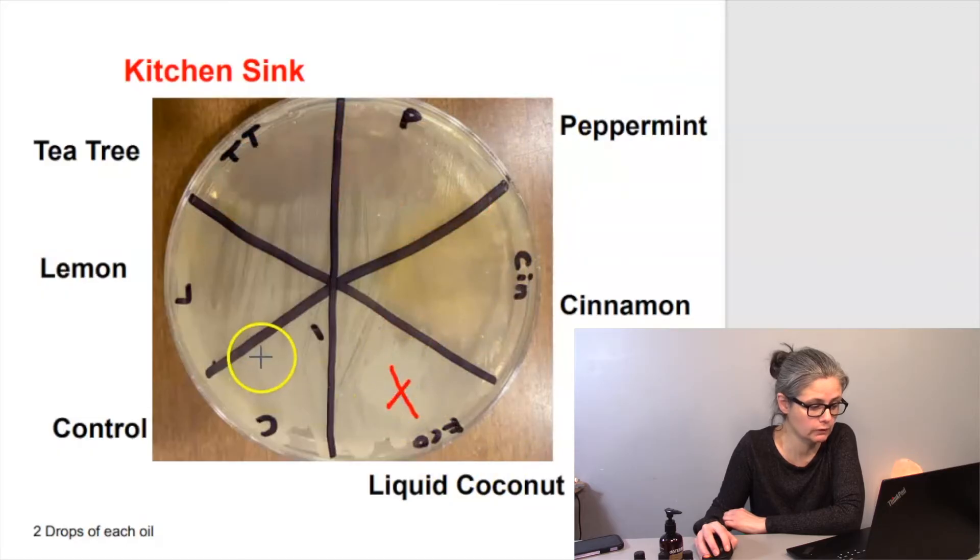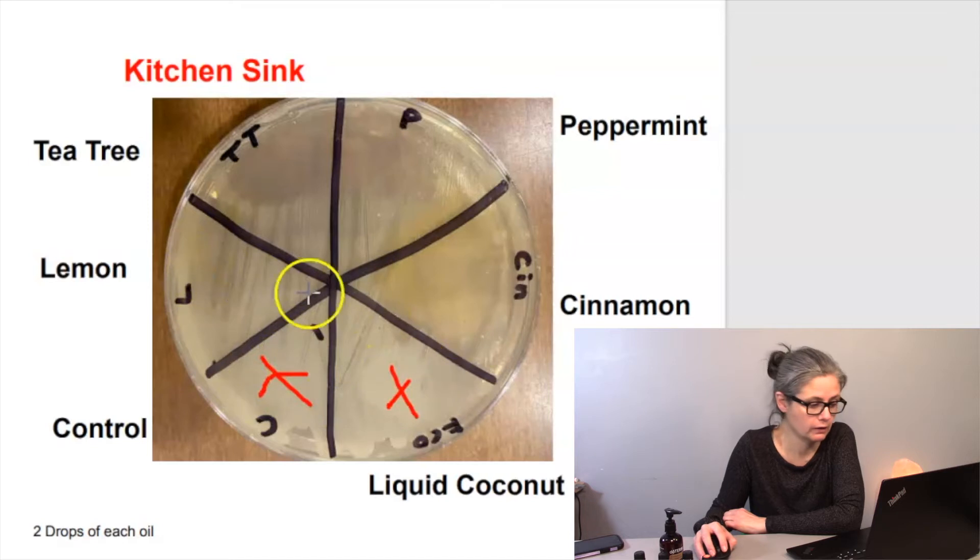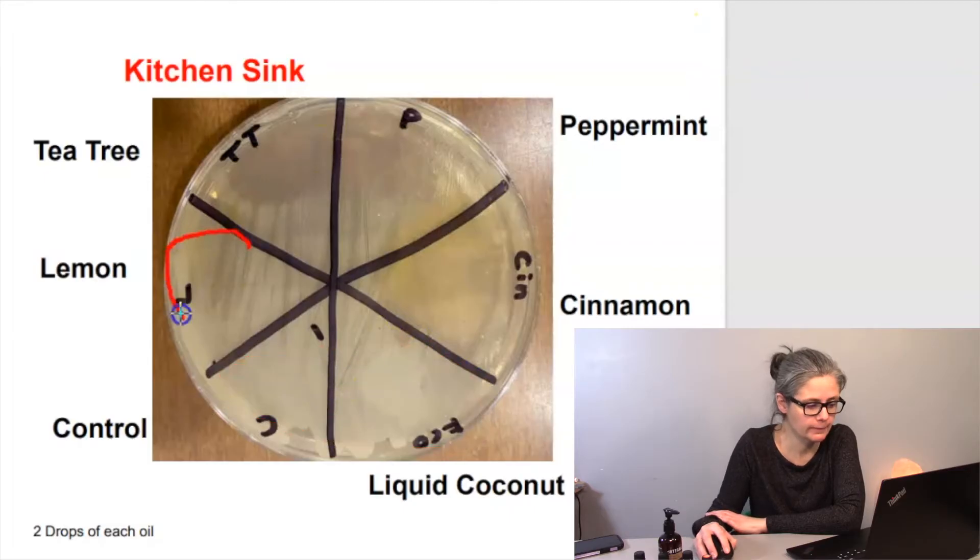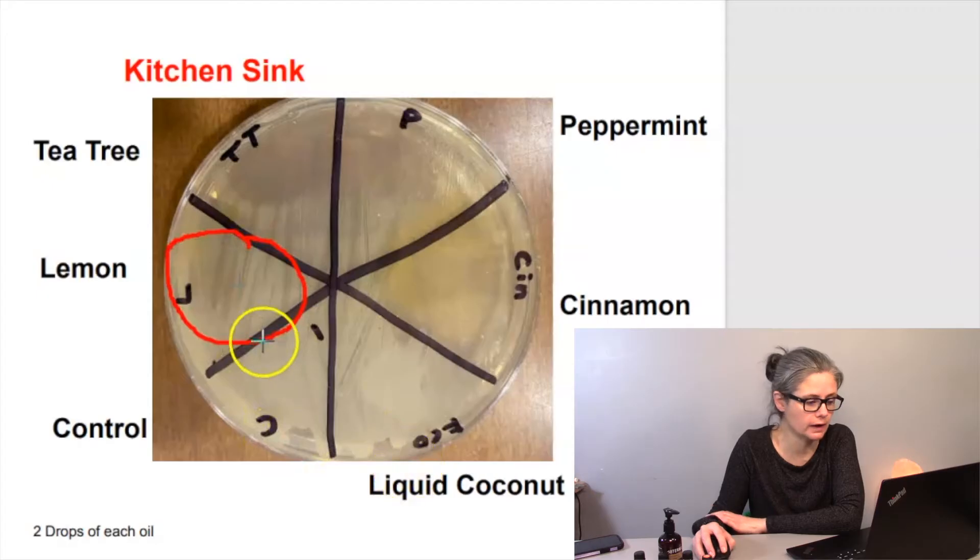Then in the fractionated coconut oil, the control, there is definite growth there. Here it looks like the liquid coconut oil and the control have about the same amount of growth in their sections. The lemon seems to have less than the control and the liquid coconut, but more than the tea tree and the peppermint.